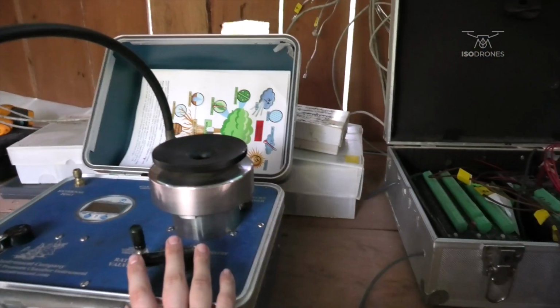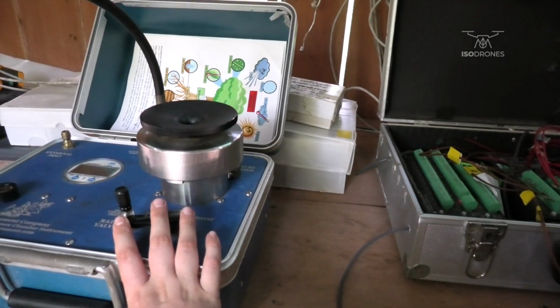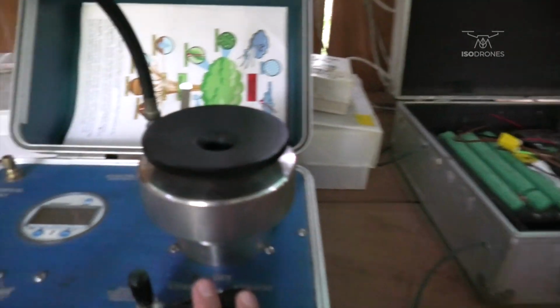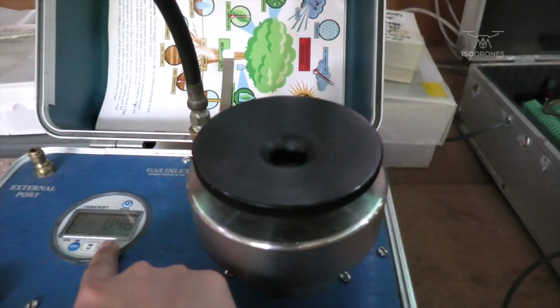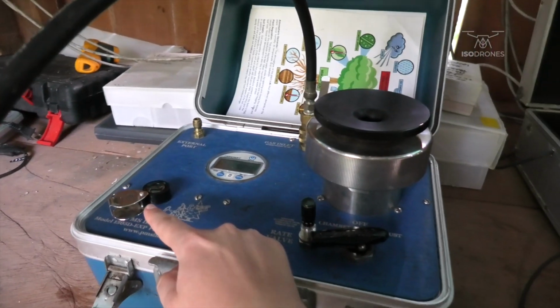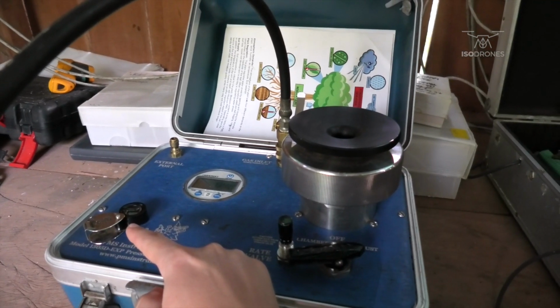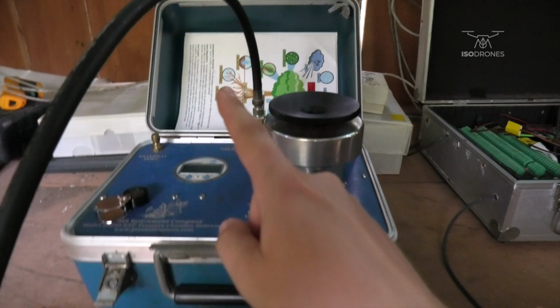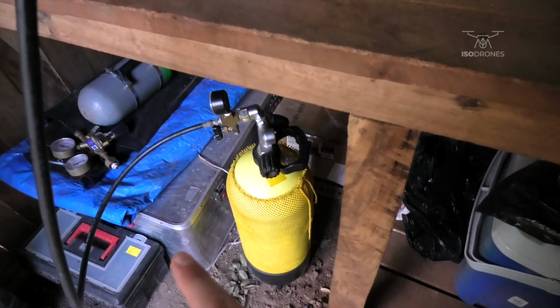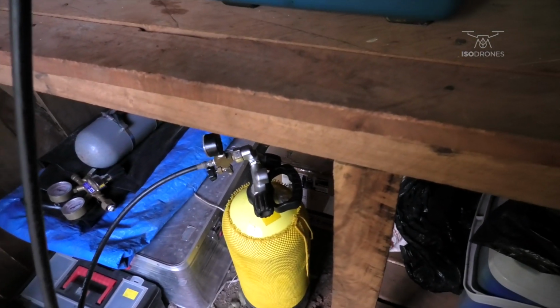You can use these regulators to increase the pressure inside the chamber, and then you can see the pressure inside the chamber here. And we have some magnifying glasses so that we can see better. And the pressure comes from this bottle of compressed air that is connected to it.